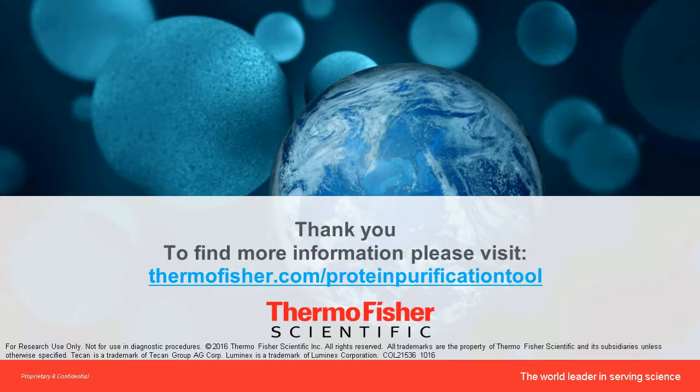Now, if you look at ELISA and Luminex, the cost is per sample, per target. With Luminex, you can multiplex 10, 11 targets in a single run, so for one sample and one target, Luminex is about $4. And because you can only do single-plex with ELISA, it comes out to about $5 to $6.